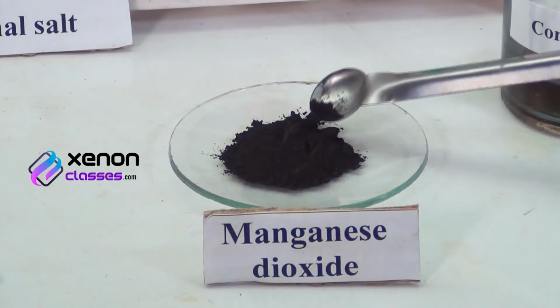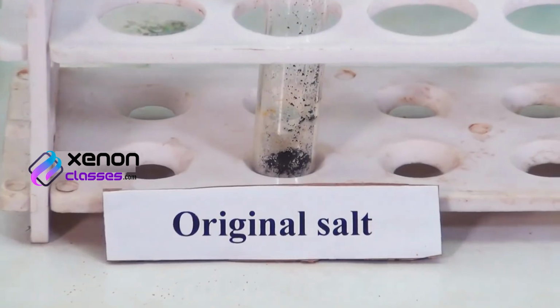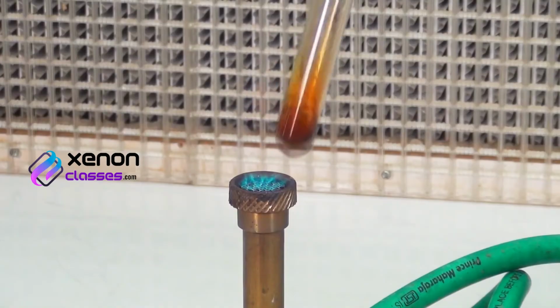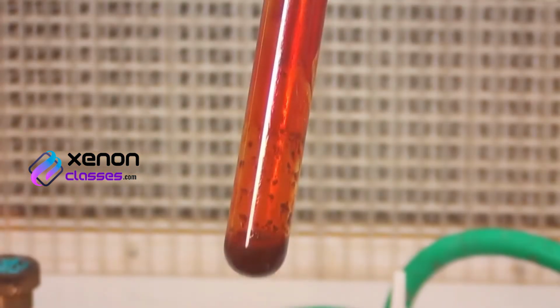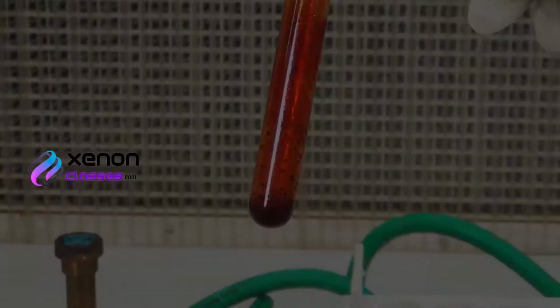To this, add a small amount of manganese dioxide powder using a spatula. Now, add a few drops of concentrated sulfuric acid using a dropper. Heat the contents of the test tube over the Bunsen burner. Bromide reacts with manganese dioxide and concentrated sulfuric acid with the evolution of yellowish-brown gas of bromine.